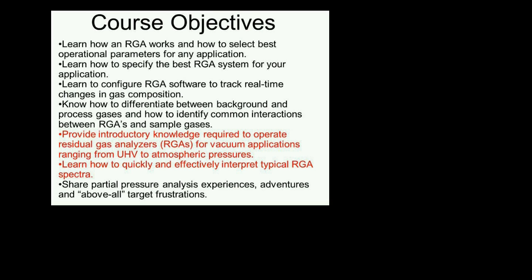We're going to also learn how to configure the RGA software. Once you buy it, you're going to have to work with the software for that device. We're going to learn how to configure it to track real-time changes in gas composition. And then that's going to take us to part 2.